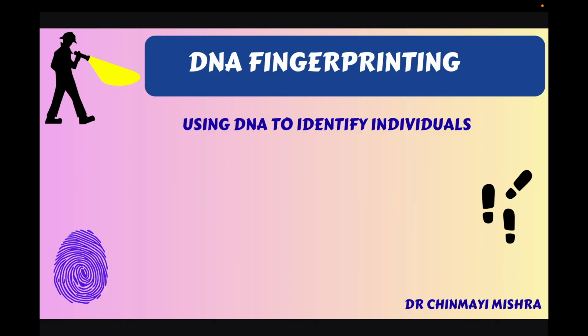Today we are learning DNA fingerprinting, a technique that uses DNA to identify people just like regular fingerprints. It's used in crime investigations, paternity tests, and identifying dead bodies. Let's see how it works.